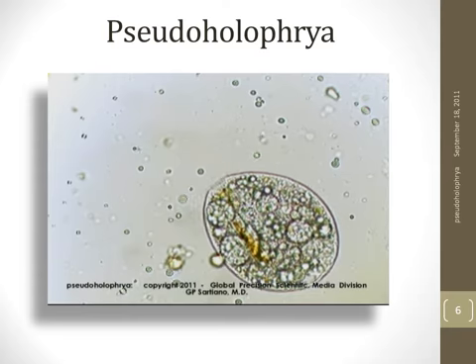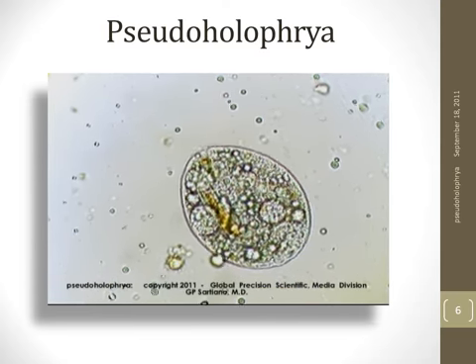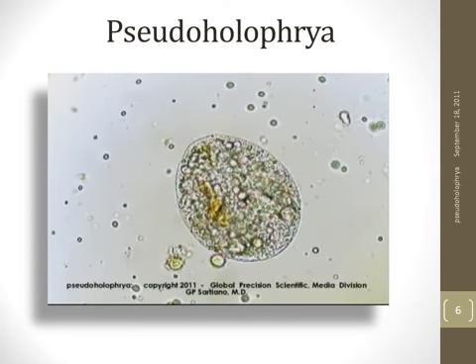Careful observation of this portion of the video reveals that visible particles are being taken into the organism's cytostome. Individual particles can be followed as they proceed down the length of the cytopharynx, which is approximately 1/3 of the length of the organism in the midline.